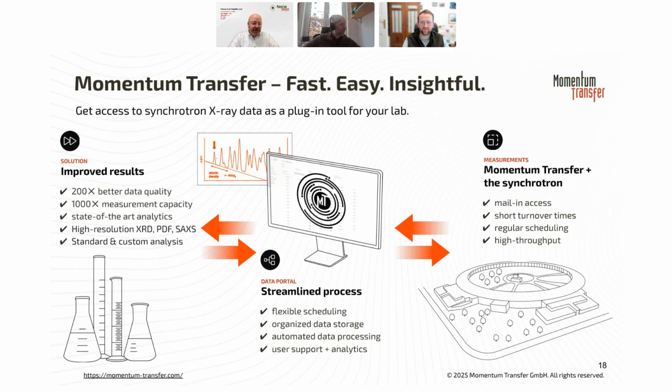We have a streamlined process, so we are actually measuring background and standards with it, and you have the data for that, and we provide it. No, operando is not possible. Sorry, Mohammed. And you have the access to this for paid and for those first 5 free measurements.